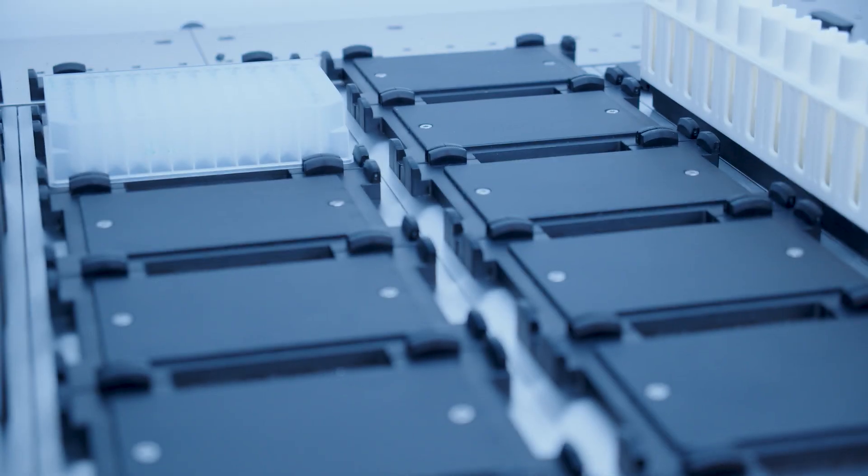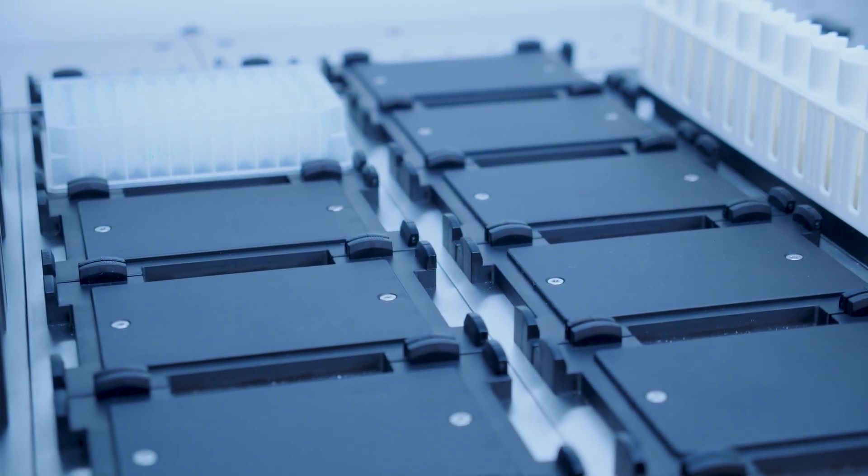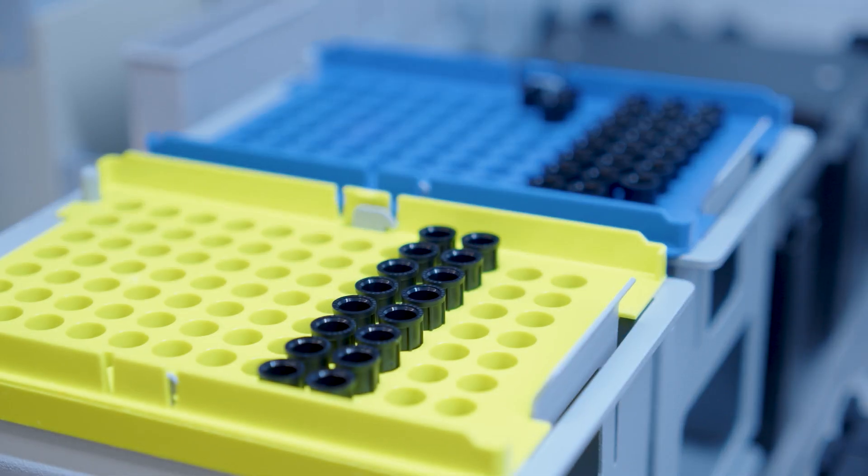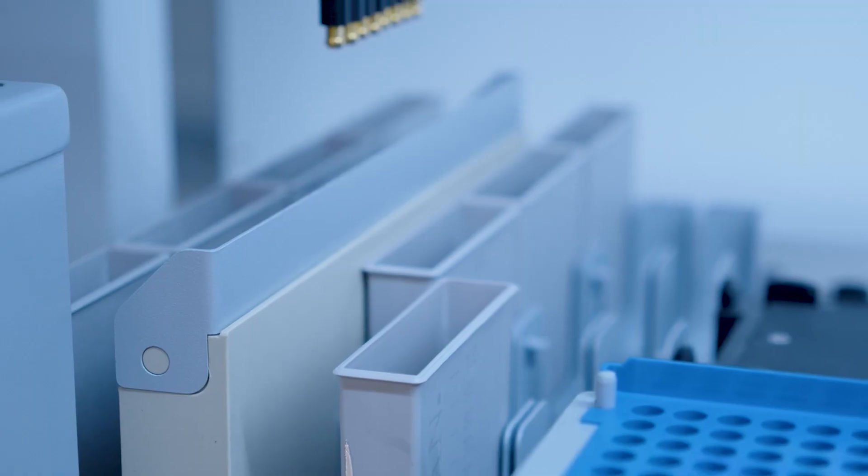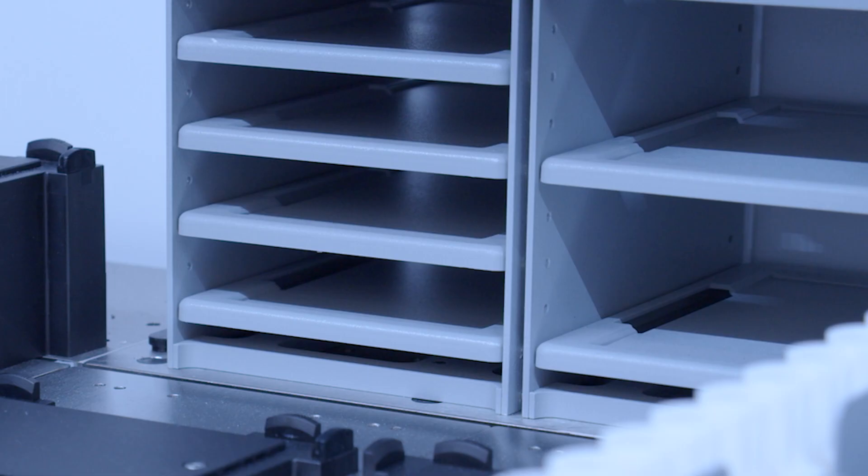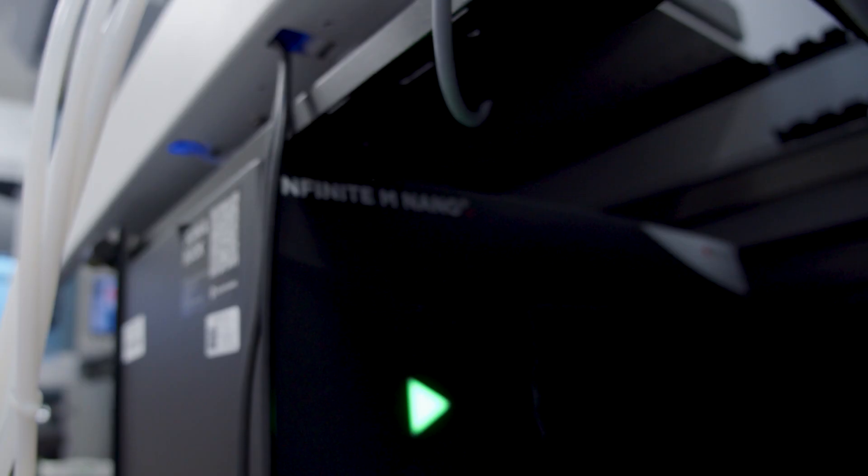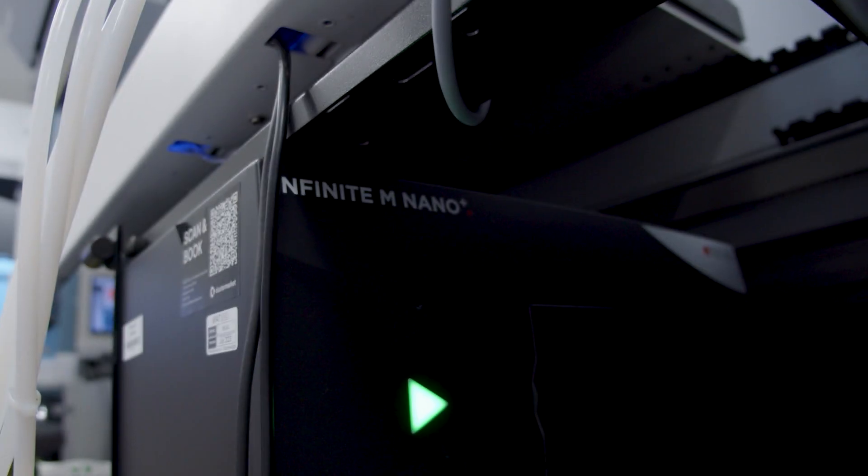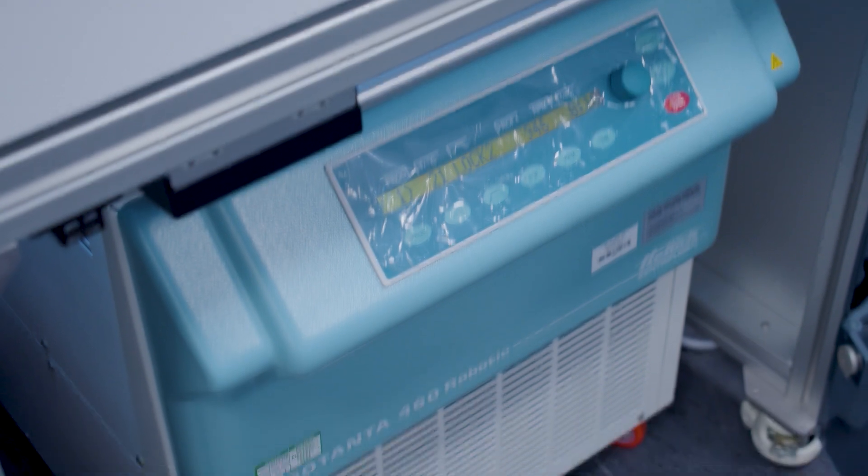The Fluent deck may contain plate carriers, tip carriers, tube holders, troughs and hotels which can store many plates. It also offers below deck access to allow the use of a plate reader or centrifuge.